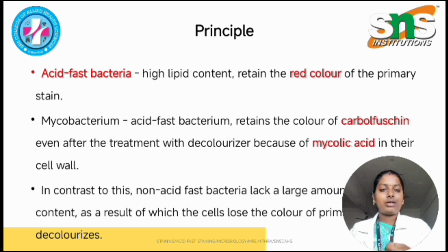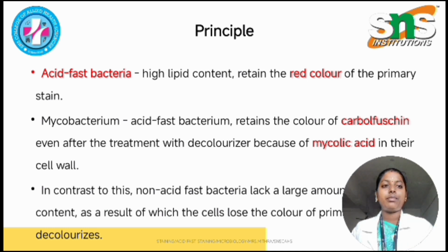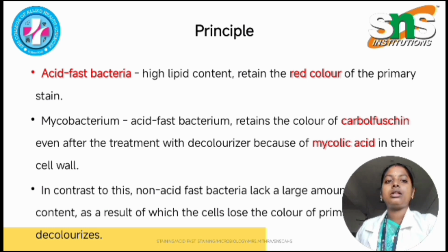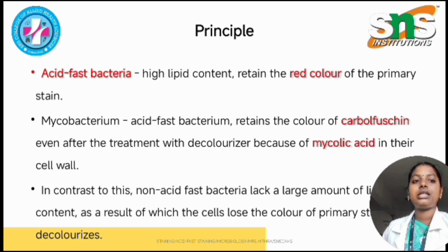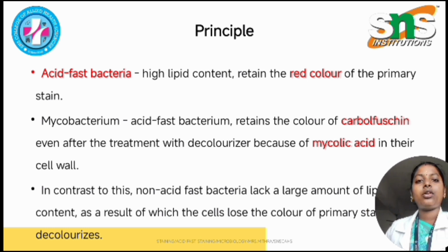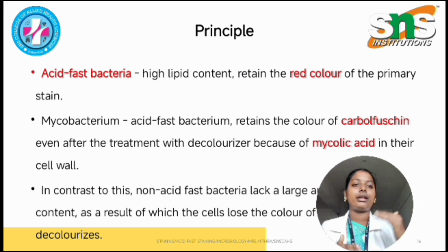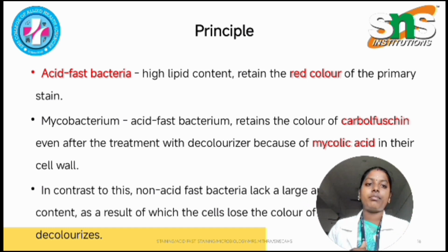In contrast to this, non-acid fast bacteria lack the large amount of lipid content. So it loses the color of the primary stain, and it decolorizes all the red color from the bacterial cell wall.